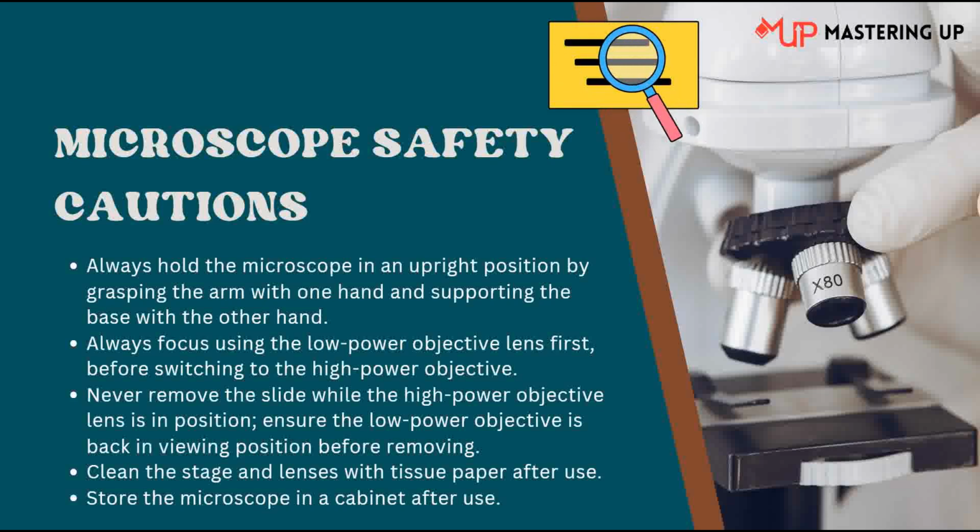We have to clean the stage and lenses with tissue paper after use and then store the microscope in a cabinet after usage.